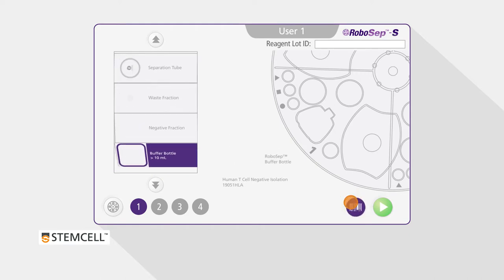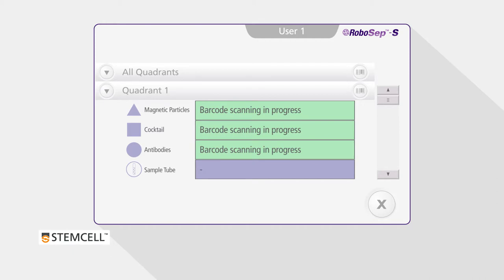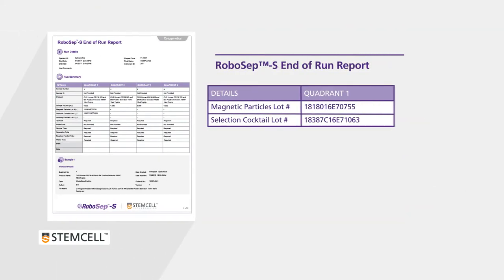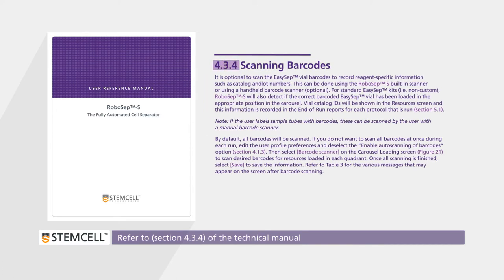Selecting the barcode button on the screen will scan the barcode on each reagent vial, so the instrument can verify the correct reagents have been loaded in the correct locations as per the protocol selected. Scanning the barcodes will also allow reagent-specific information such as catalogue and lot numbers to be recorded in end-of-run reports. For more details regarding the RoboSep-S barcode scanner, refer to Section 4.3.4 in the technical manual.